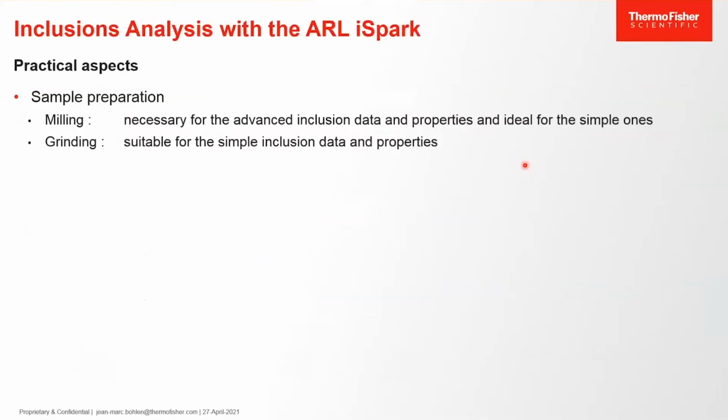At this point, I think it's useful to tell a few things about practical aspects of the inclusion analysis with the Spark OES. The first thing to mention is sample preparation. There are several ways to prepare a sample for optical emission.